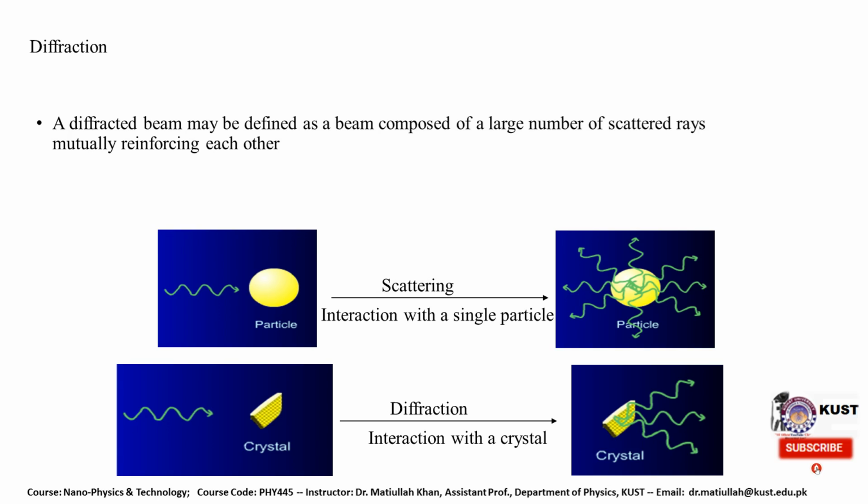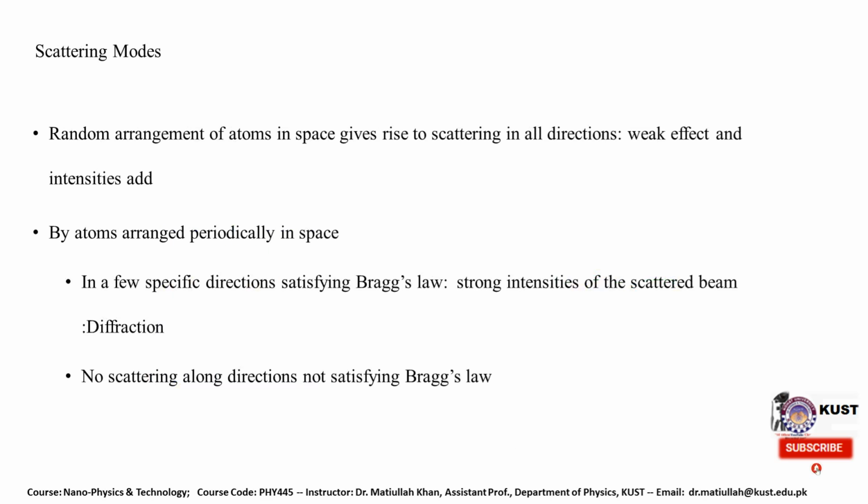We have two possibilities: whether the particle will be scattered and randomly move in different directions, or whether the particle will be diffracted, that is, interact with the crystal and be mutually reinforcing each other and collected at the detector.